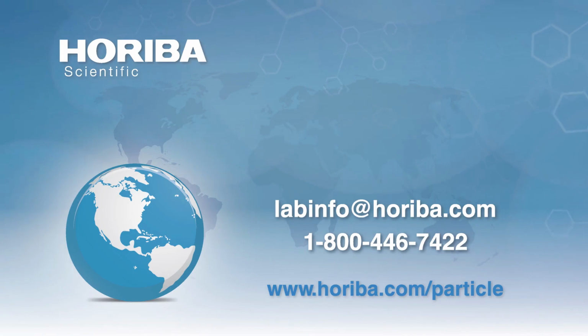So I guess the first question, what is the best techniques for creating multi-particulates and maintaining their integrity during capsule filling? Okay, I guess I can handle that question, Jeff. For me and the experience that we have here, creating a multi-particulate and being able to maintain its integrity, I mean, fluidized bed technologies, whether you're using Wurster, and in some cases, perhaps other approaches such as top spray or tangential or even powder layering. Fluid bed by far is the best technology to use to create a multi-particulate dosage form.